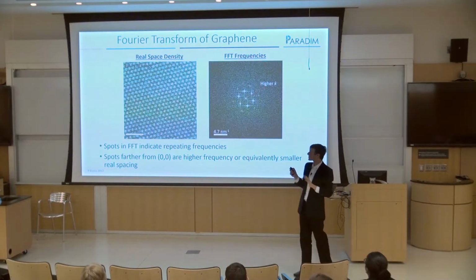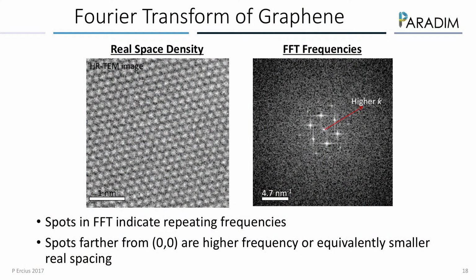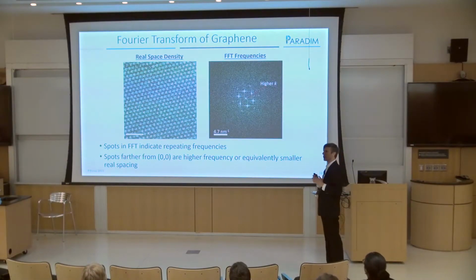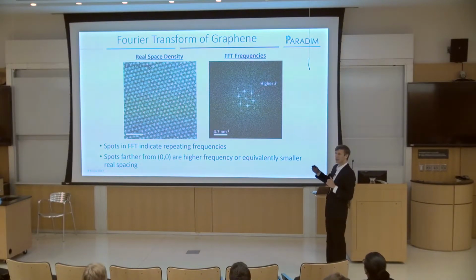So let's look at some images and at the Fourier transform of those images, and from an intuitive imaging standpoint, let's think about what this tells us. When I am on the microscope, I take a Fourier transform of almost every image I look at, because I can look exactly at the quality and what is going on. You can see where atoms are. This is actually graphene taken in a normal aberration-corrected HRTEM. But here, if you take the Fourier transform of this image, you see dots, right?